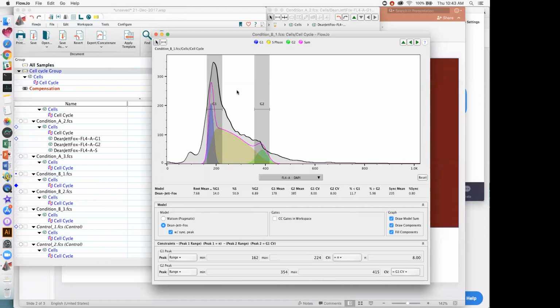Okay, so there's a question here about the RMS. The bigger the RMS, the better then? No, the lower the RMS, the better the model, or the better the model fits the raw data. When you're working with the RMS and there are very small changes to the model, at that point, whether it's bigger or smaller is kind of irrelevant.